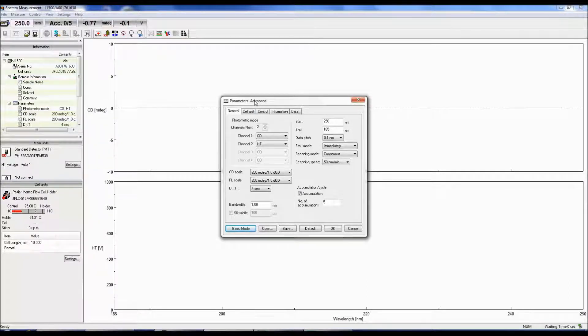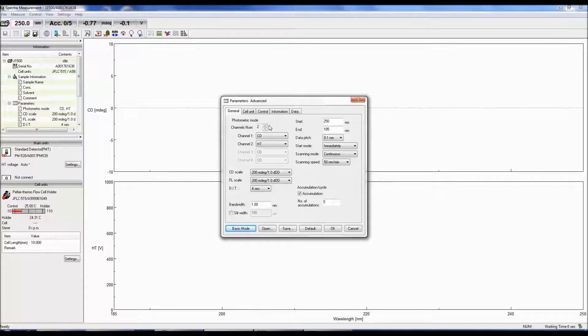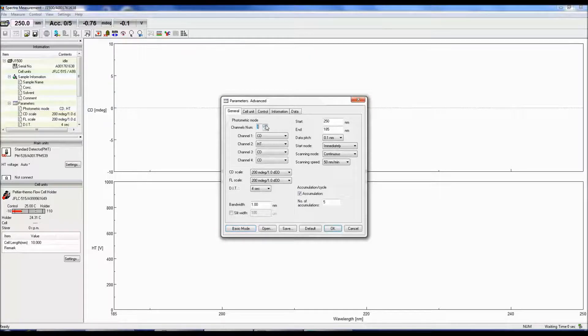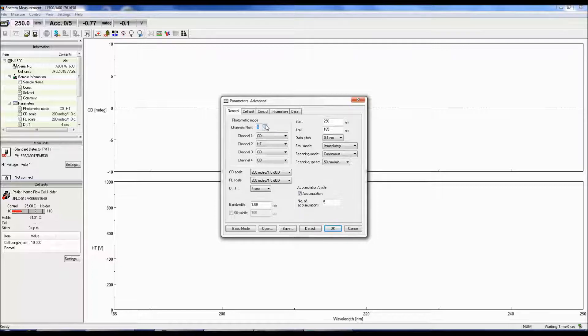Here you can specify how many photometric modes will be measured. You can select up to four channels where the data will be acquired simultaneously.